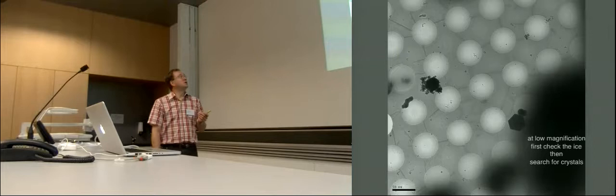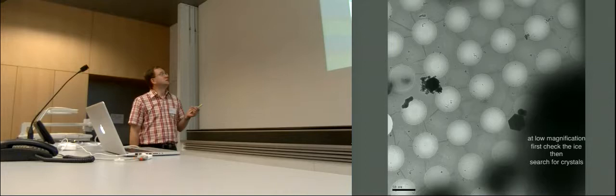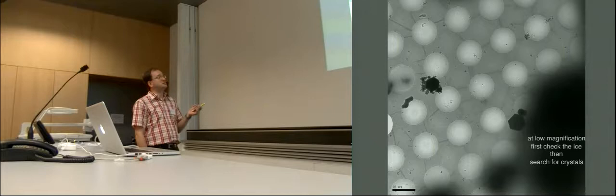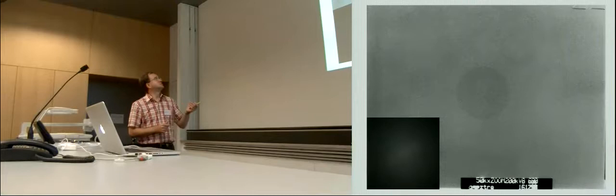Once it's in the microscope, you have a quick look at low magnification to see if you have good ice. Here we have some hexagonal ice, thick ice, thin ice, and empty holes. The image of 2D would be with very low contrast, like completely gray. Here at 50k on a 200 kV, this was actually a Hitachi machine.